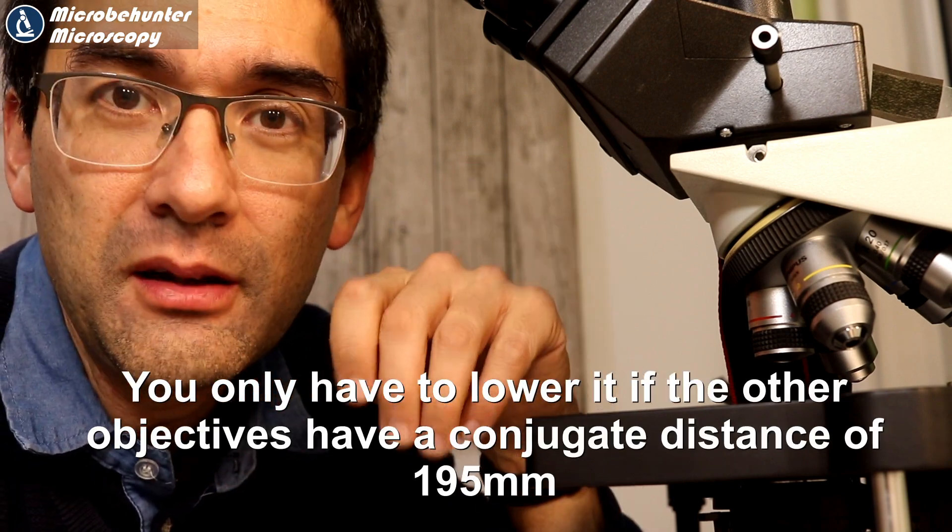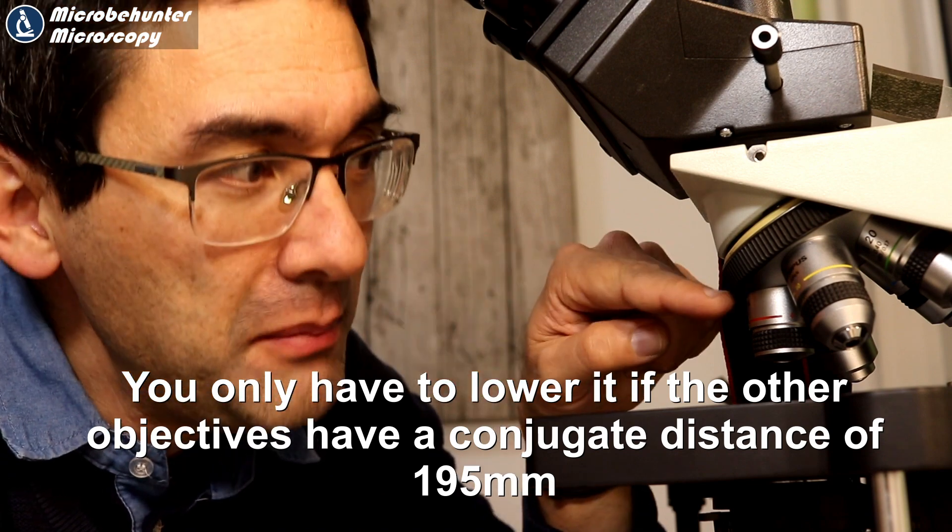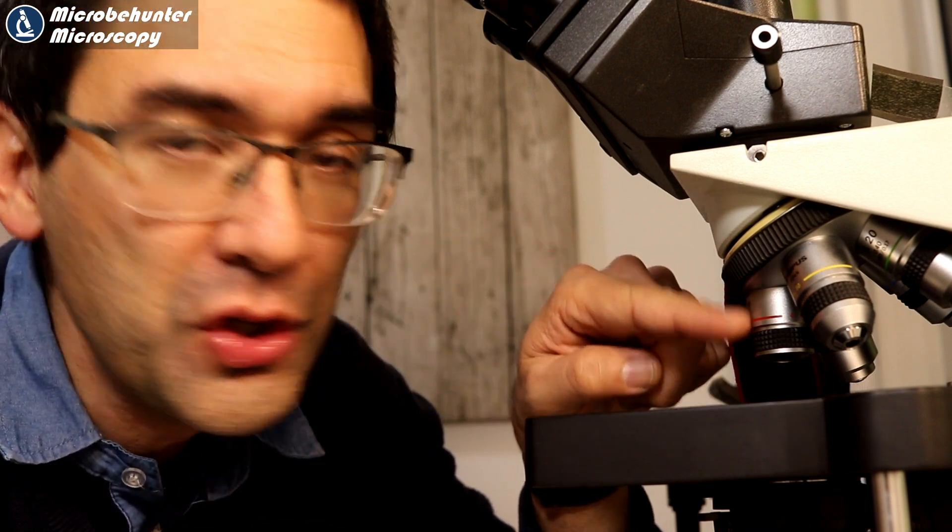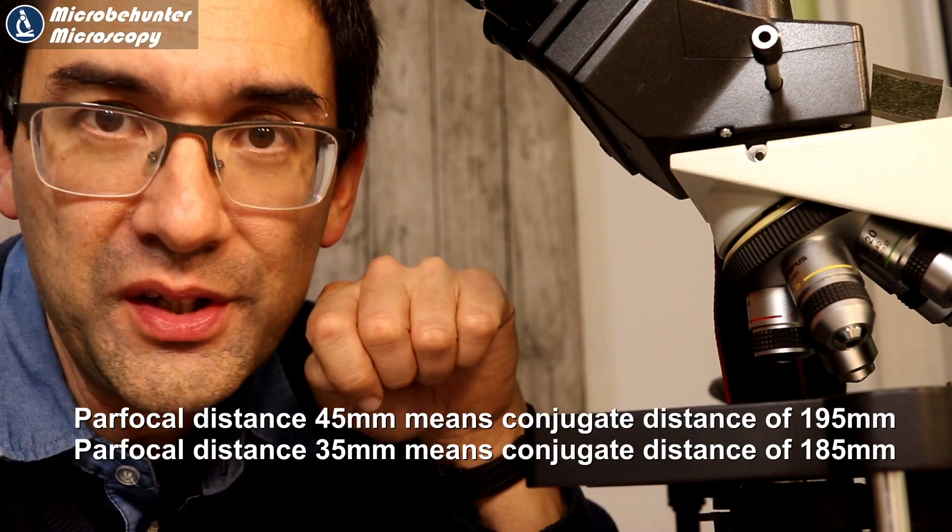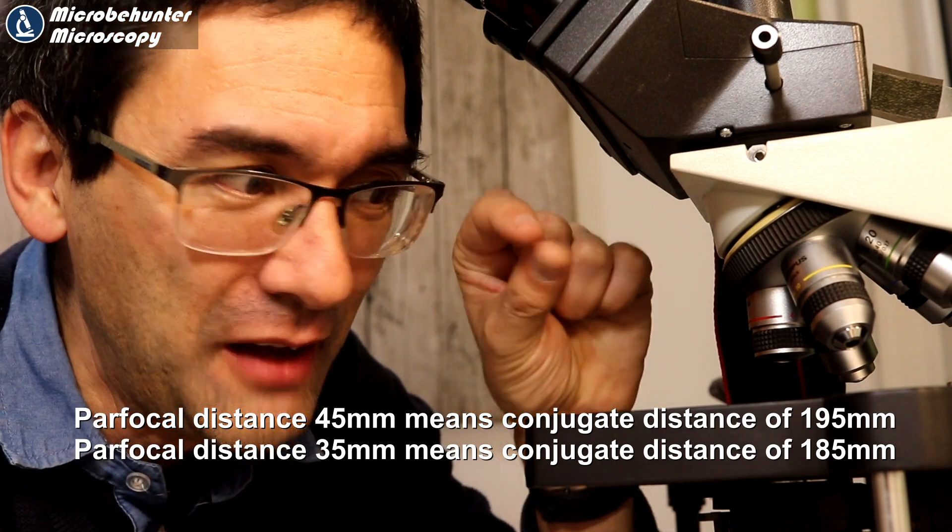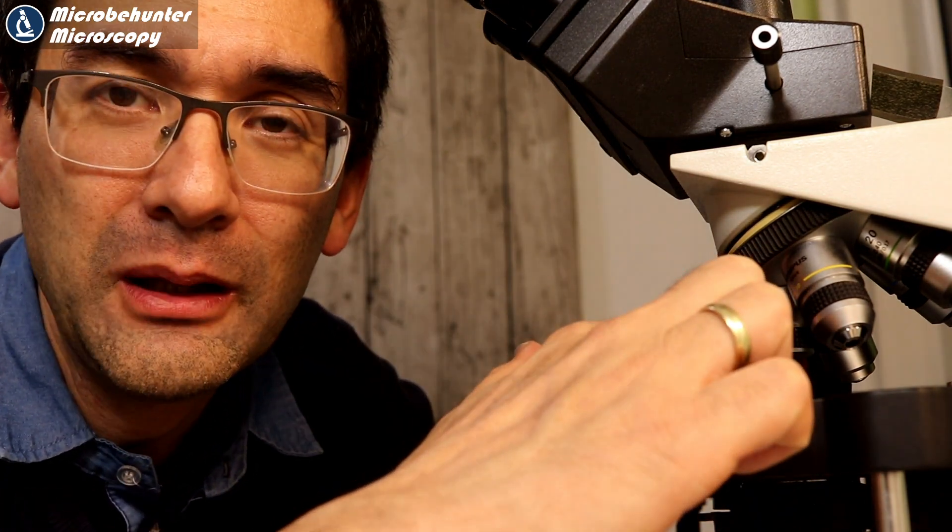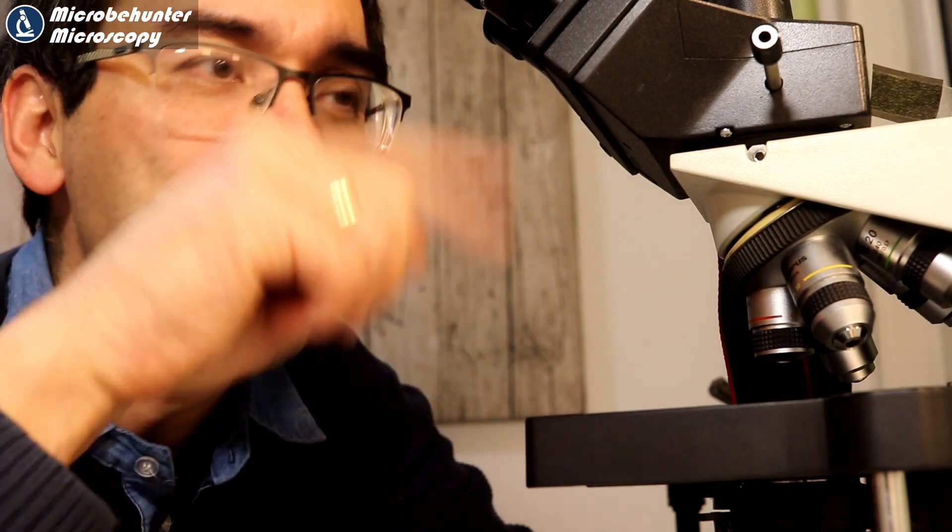That is basically the short explanation, but for the measurement of this distance - the 45 millimeters in my case - you only measure when the image is in focus. Don't forget to put in a slide because this is about one or one and a half millimeters thick. So I have 45 millimeters, which means 45 plus 160 minus 10, which is 195.